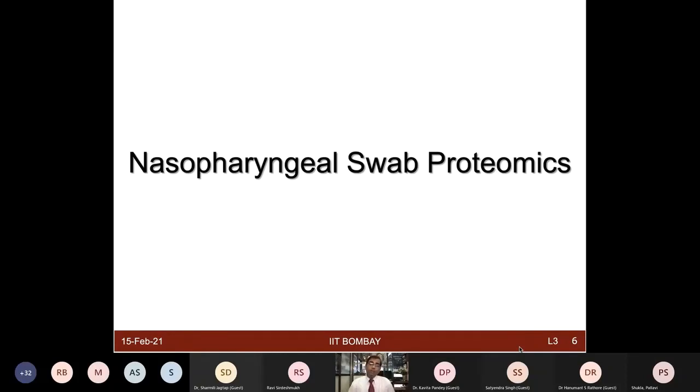And now for doing this type of project, think about a situation like lockdown, where labs are all shut down, and we are thinking to work on a sample which is very unsafe, a very difficult sample to work with. And these swab samples are being collected in a tube which contains viral transport medium, VTM. Now this VTM comes from different vendors having different compositions. It also contains sugar, it contains albumin. So it is a very challenging sample to work with. And this was the real test, how best to do something on this type of sample in a safe manner.